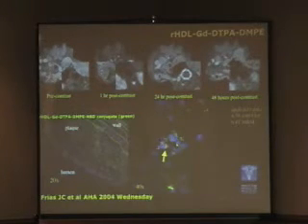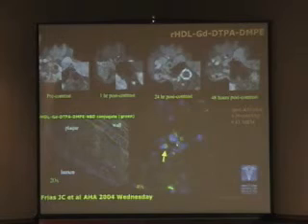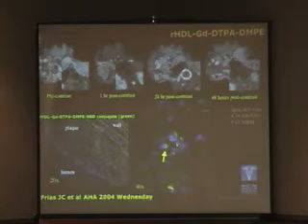And you can see that with the confocal microscopy here showing cellular uptake in the macrophages. What's also interesting is that the particle by itself, which does not have any target right now, naturally goes in and enhances the vessel wall at 24 hours, and after 48 hours it gets out. So it's really going in and going out, and we have ways, and you can imagine ways, we can potentially make this stick into the vessel wall and target certain epitopes. So we will be following up. J.C. Frias will be presenting this when everybody left already on Wednesday. But for the people who are here, we'll see this.